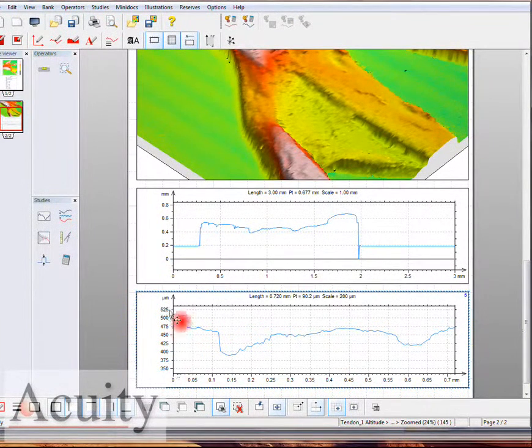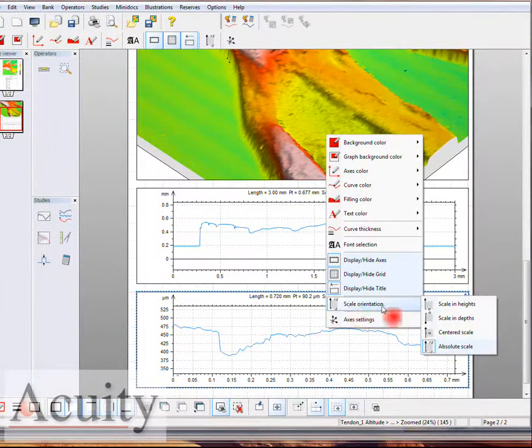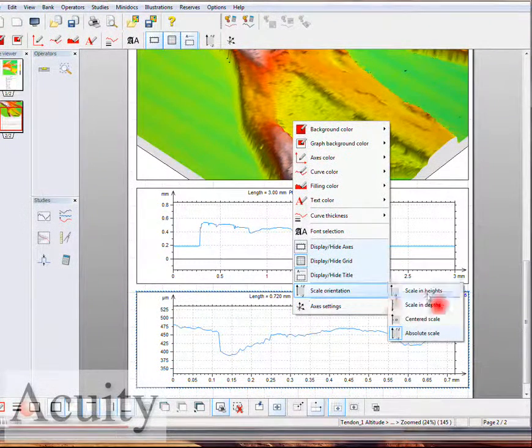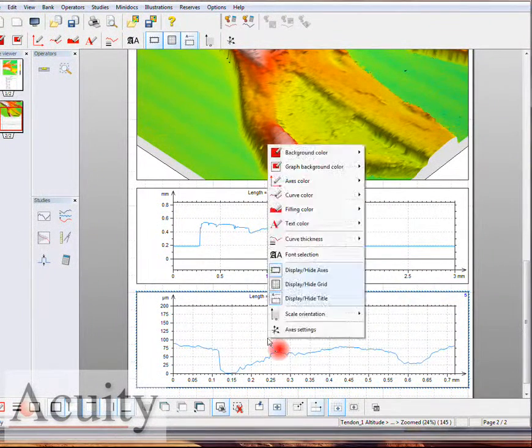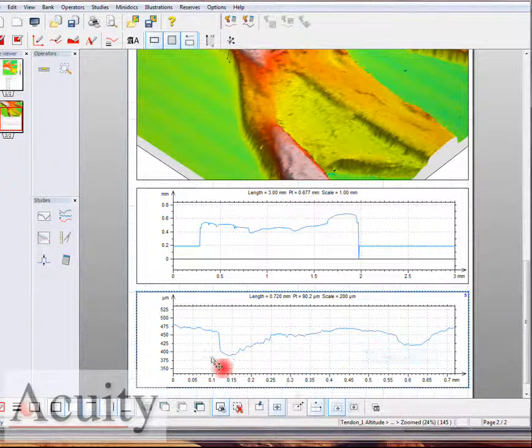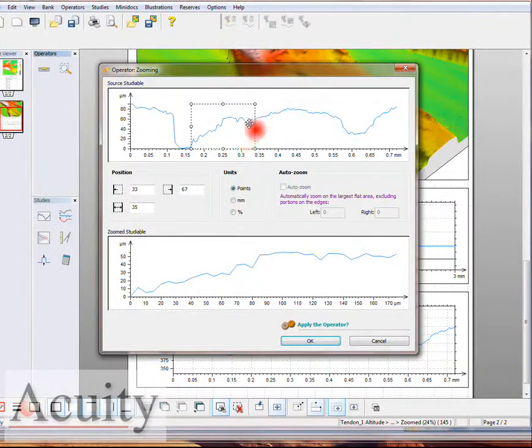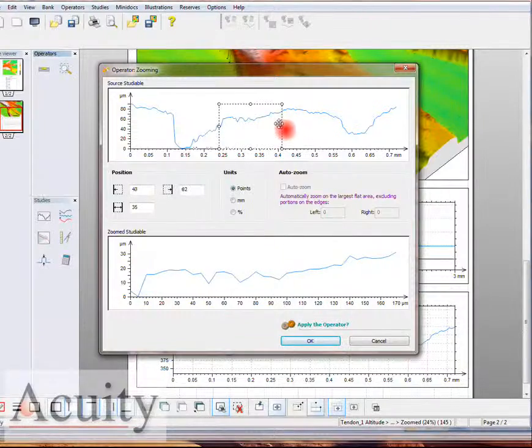This is roughly, let's just orientate this scale, put it in heights. Let's put it absolute so you can see the detail we're getting.